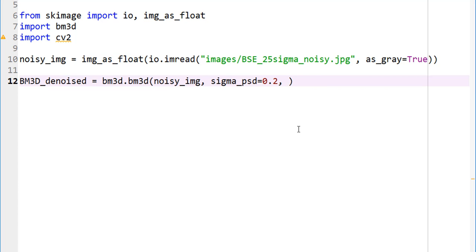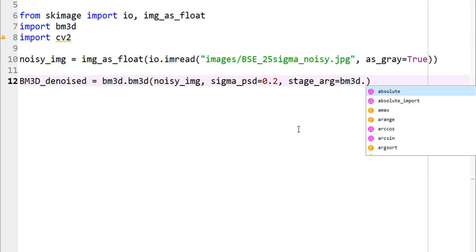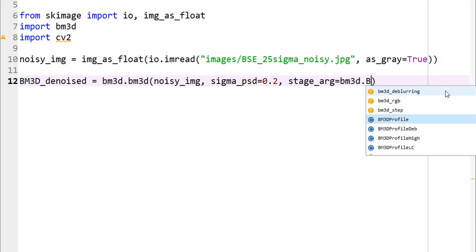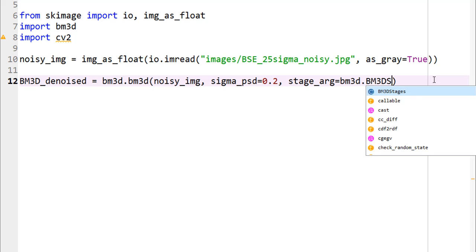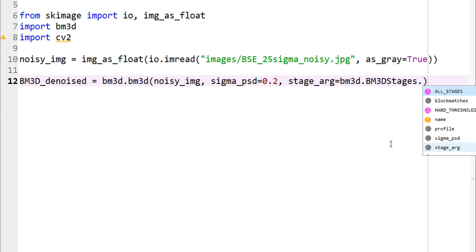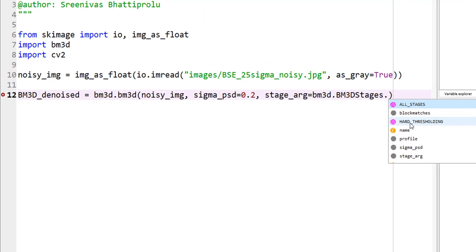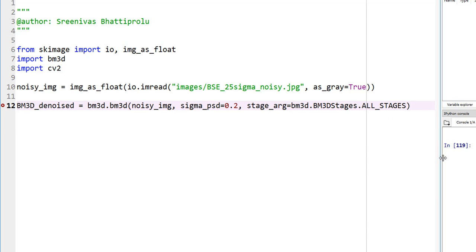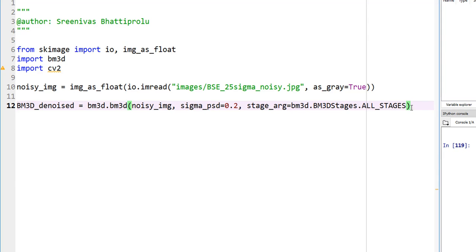The other one is stage_arg. There seems to be two options here: BM3D stages. I don't know if I can find it here, but let me go ahead and type it: BM3D.stages. So there you go, stages. Within stages, we need to pick whether it is hard thresholding or all stages. These are the two options. Hard thresholding is slightly faster because all stages does hard thresholding plus Wiener filtering. I quickly ran this once and realized the output looked very similar, but let's go ahead and use all stages for now. That's it.